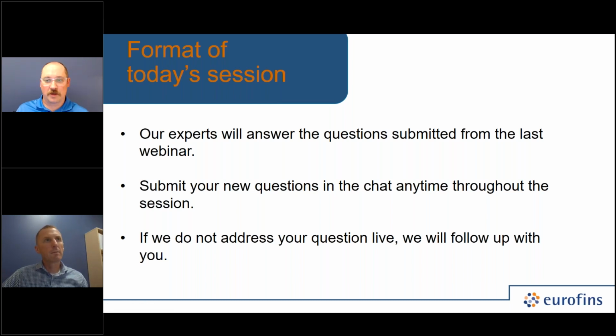Sure, yeah, that's a good one, because as I mentioned, it's real-time data, but of course there's preparatory steps involved. So when we're talking hours, a single sample using the ISO protocol we typically use, from the time you weigh it to putting it on the instrument, you're looking at about an hour.